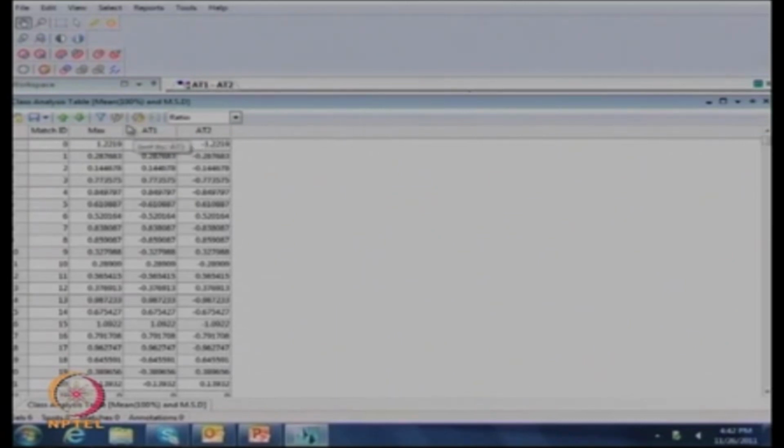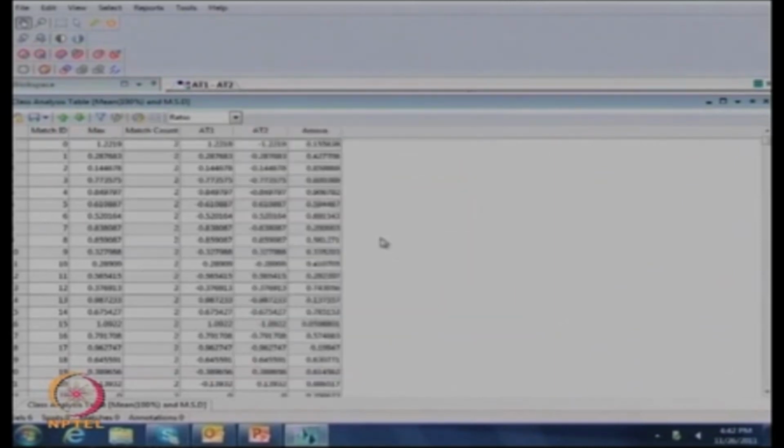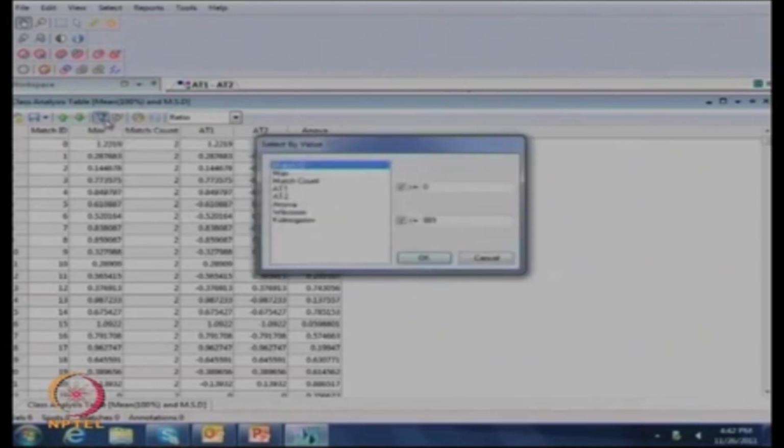Now this is the statistical parameter. The software gives you the option for doing different types of statistical analysis. Exactly. So this is the ANOVA value which we can see. On the basis of this ANOVA value, we can easily select our protein of interest, and you have the fold regulation also. This is 1 fold upregulated and this is 1.2 fold downregulated. The same way you can see the whole values. Now there is no need to go to each individual spot. You can filter them easily.